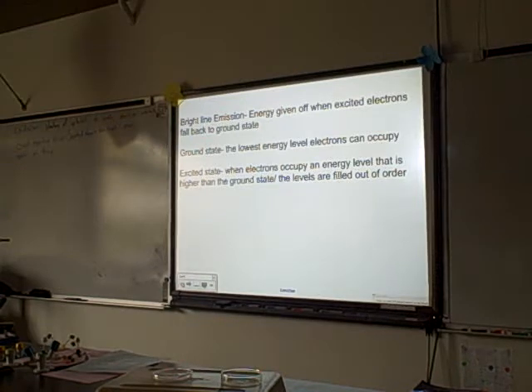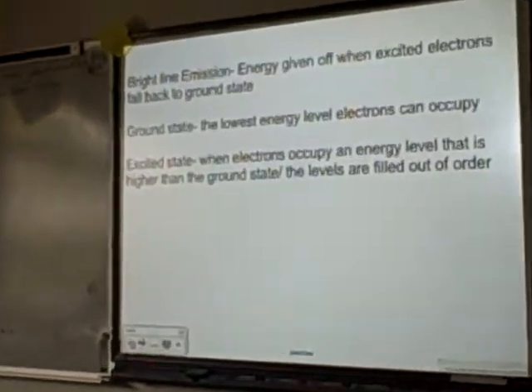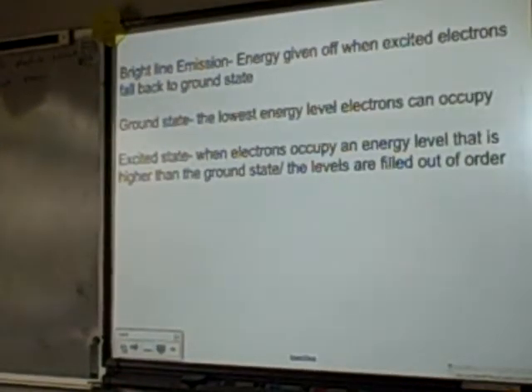Okay, so the flame you can see on the left, you can just barely see. It's really, oh, there it is. Really red. That is a strontium chloride solution. And there was a much smaller one on the right that was purple. And it went out really fast and was uneventful, so I'm not going to redo it.